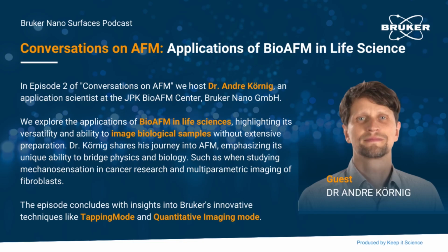There's a huge development. One is basically speed, how quickly you can take an image. When I started AFM, one image would take 10 minutes or something like this. Now there's a lot of fast imaging AFM on small molecules. There the sizes matter: the smaller, of course, the faster you can go. You actually have to slow down the recording to be able to see it, because our eye just sees 20 to 30 frames per second. So you can record faster than you would be able to see.